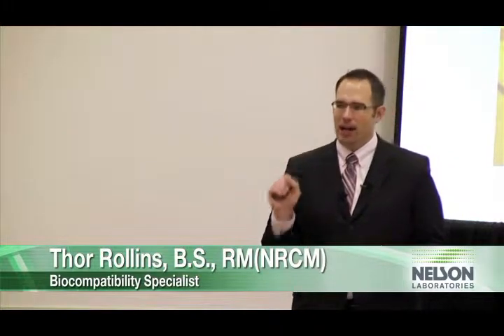Okay? Which sounds horrible, but really it's good because the cyto is also the cheapest and quickest test to run. So it's a great way to screen raw materials before you even put them into a final device to see what the impact is going to be to the body. But that being said, everyone's familiar with USP Class 6 criteria. Be careful of USP Class 6. USP Class 6 does not include cytotoxicity. And as I just mentioned, cytotox is the most sensitive. So I have tons of people say, how can my device fail cytotox? It's USP Class 6. It didn't do cytotox to get USP Class 6.